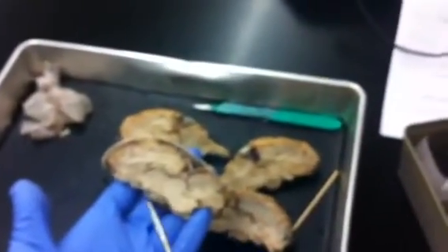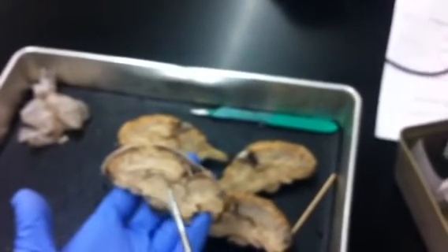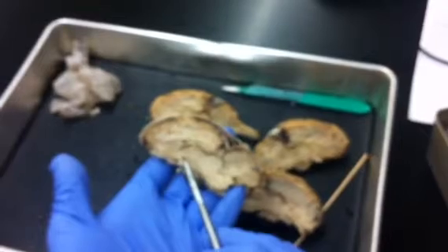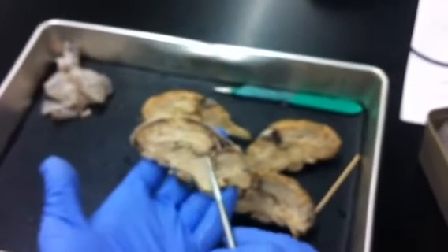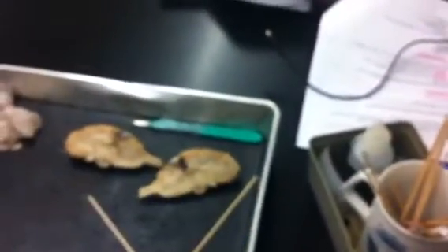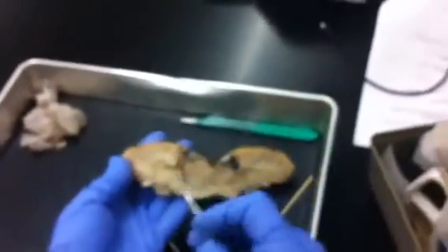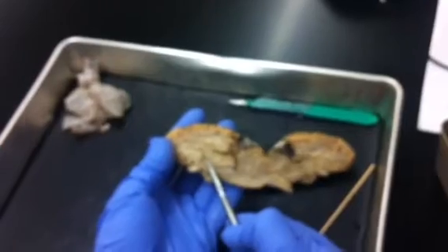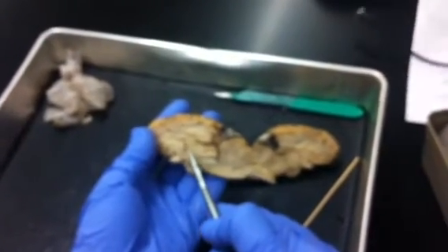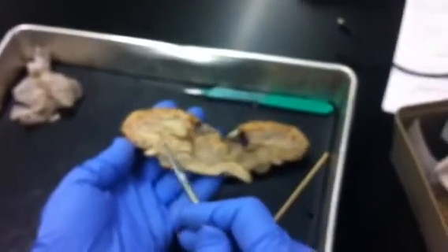Now, the diencephalon, middle part of the brain. So right here, where it's kind of roundish, is the thalamus. Hypothalamus is down here. Epithalamus on the back side. I'll show you how to tell that a little bit better. Let me look at yours. Yeah, okay. So here, see where it's kind of roundish right there? That's the thalamus. The hypothalamus is down from it.